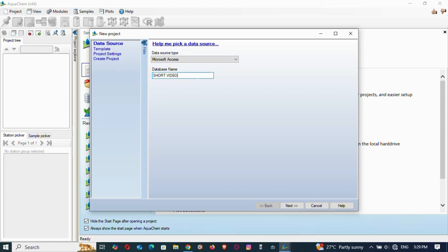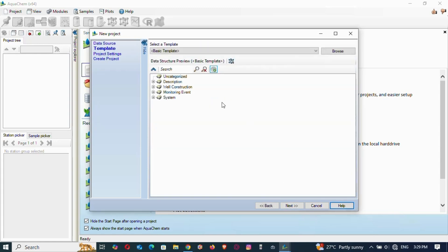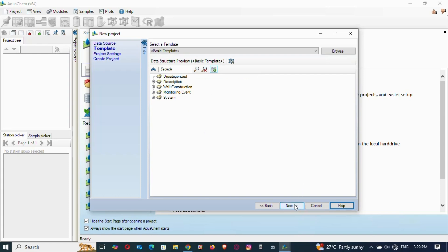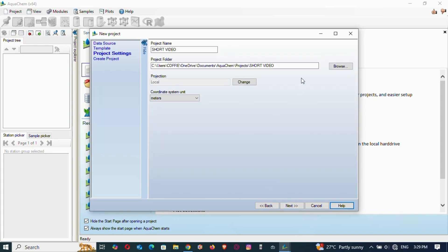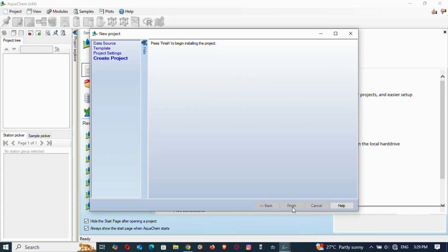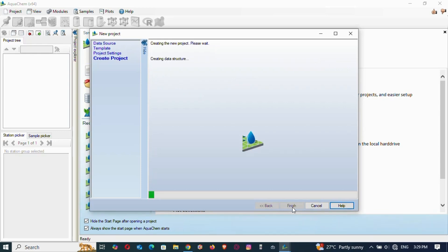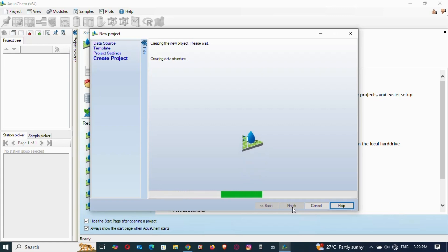Give the file a name — I'll call it 'short video' — then click Next. Don't select anything special, just keep going next. These are the default settings; you can browse to change the location but I'll leave it as is. Click Next, then Finish, and it will create a new project page for you to start with.